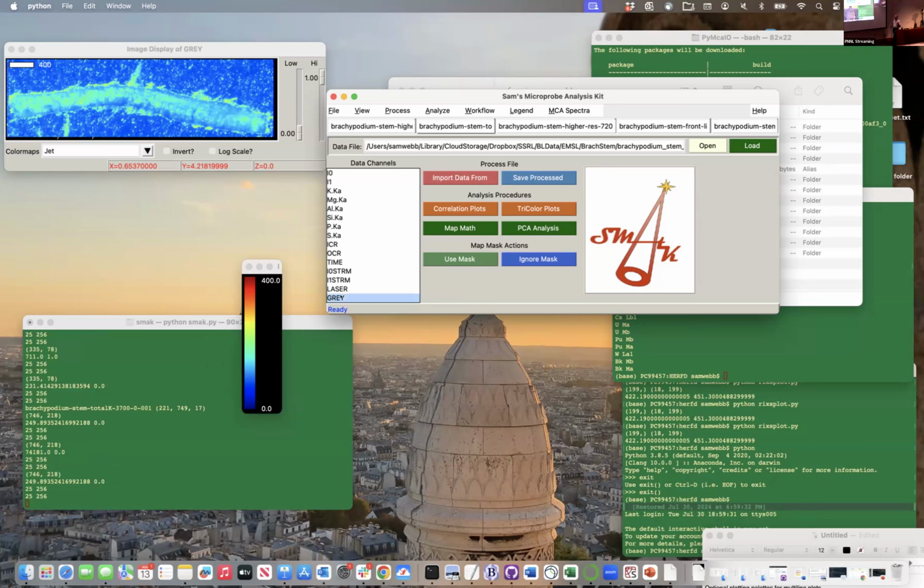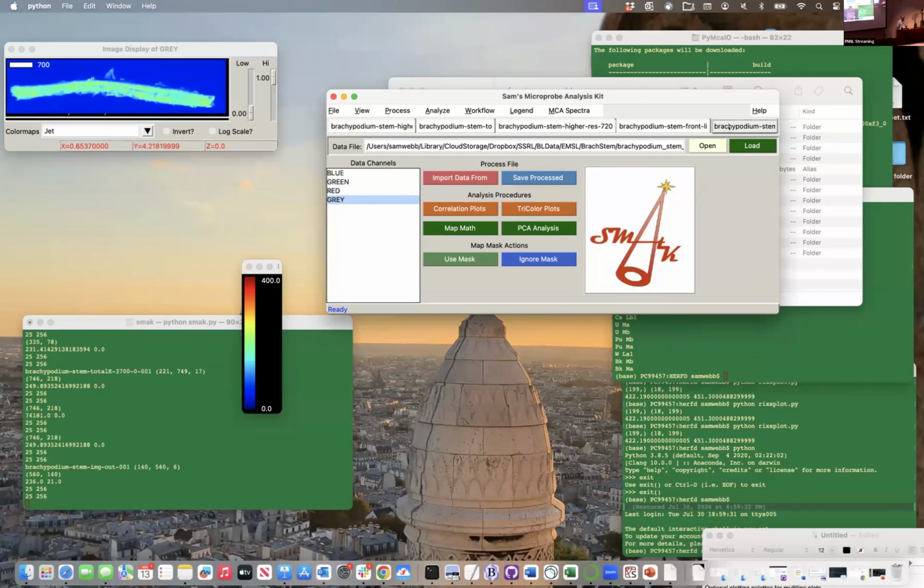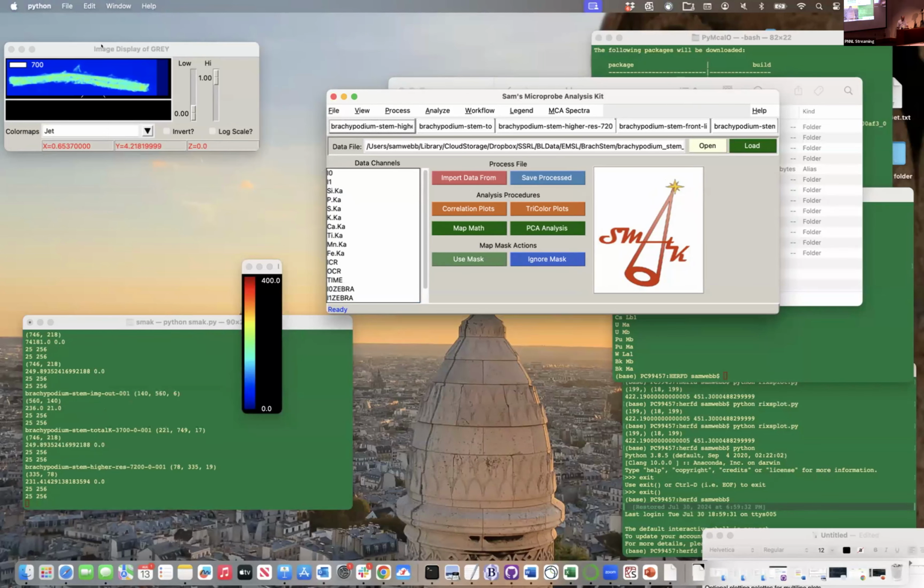If, for instance, you took the image at a different focal plane, it might not mesh together. So I'm pretty sure that the 7.2 image here was not taken in exactly the same scan area as the data, because when I put it together, they're in different areas. You can see this little blue part over here. It doesn't have the same aspect ratio, even without sampling.